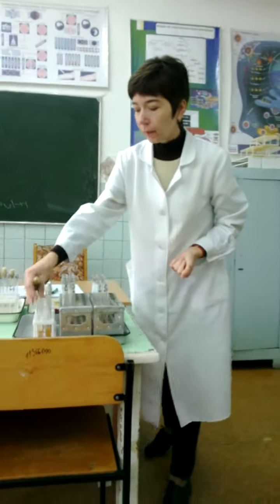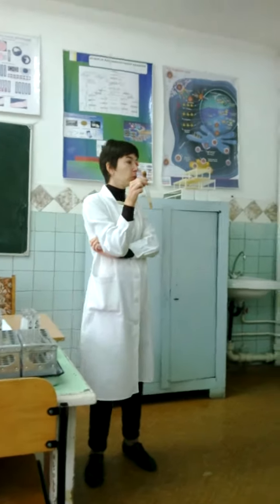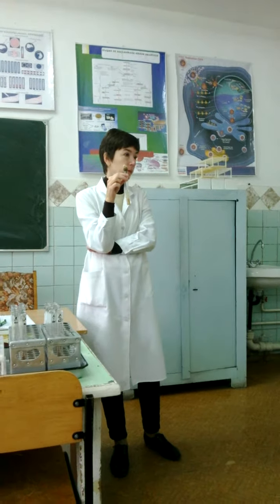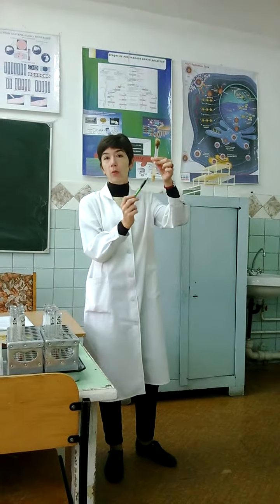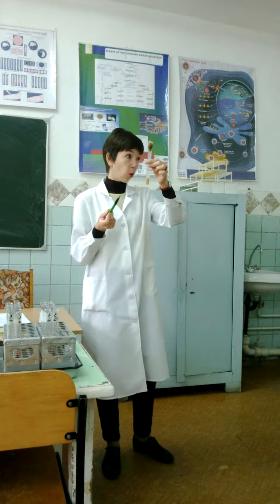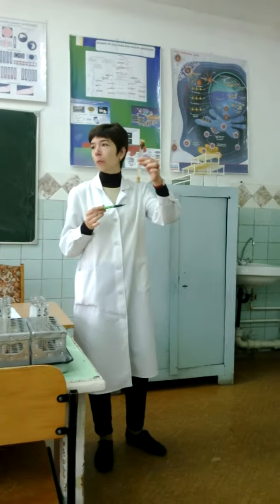Anaerobic bacteria. It's enriched media. This media is used for isolation from the primary sample, bacterial isolation from the first sample, and for enriched culture. It's a liquid media, containing cooked meat, 1% glucose, peptone water, and sometimes we may add 0.5% agar.